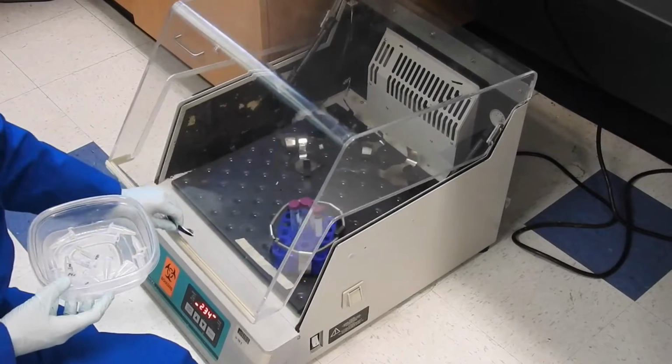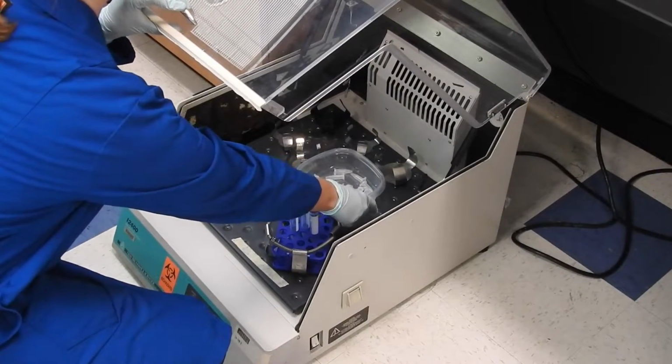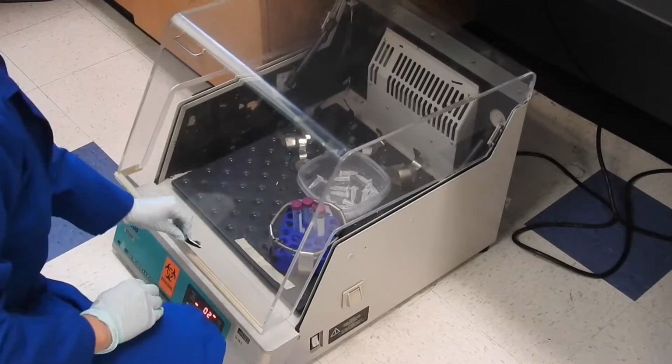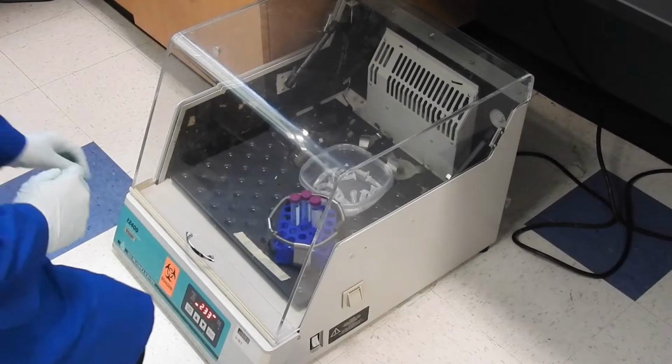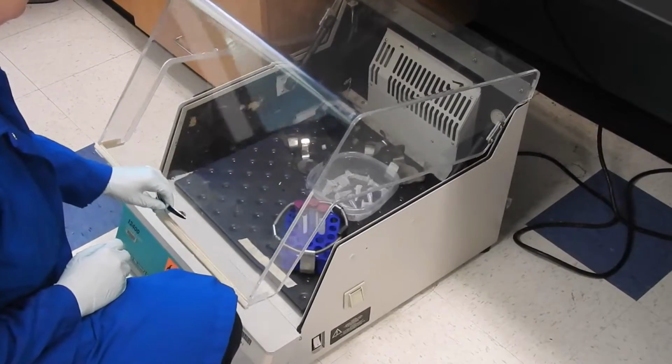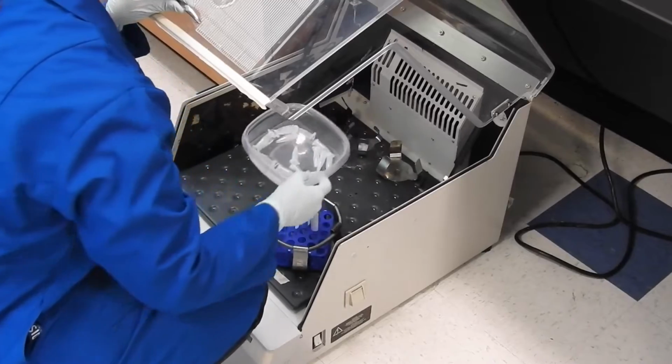The tube is placed in a container along with the tubes from the rest of your class and placed into the shaker. Now you can see why labeling the tube is very important. The shaker is at 37 degrees Celsius, which is the optimum temperature for E. coli. Shaking the tubes keeps the liquid aerated. After shaking for at least 1 hour, the tubes are removed and the cells are ready to be plated on LB medium.